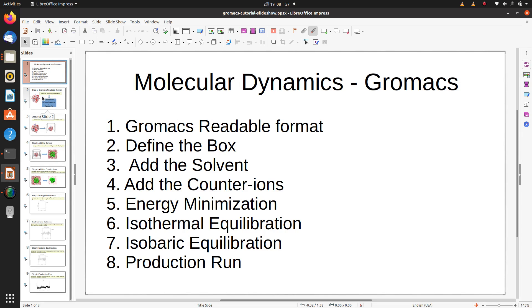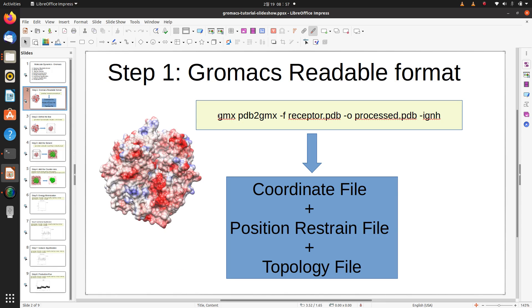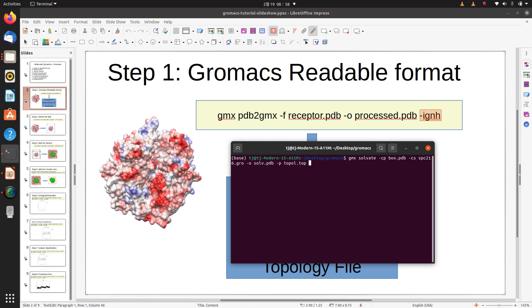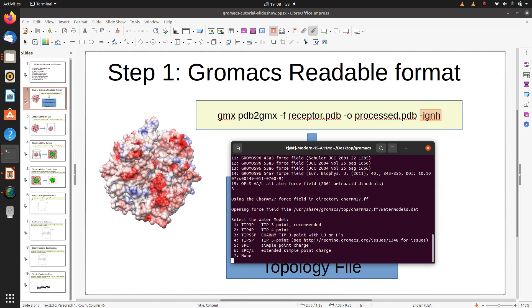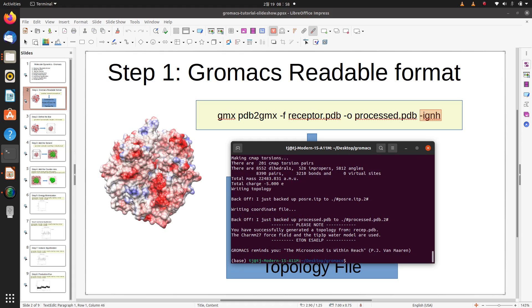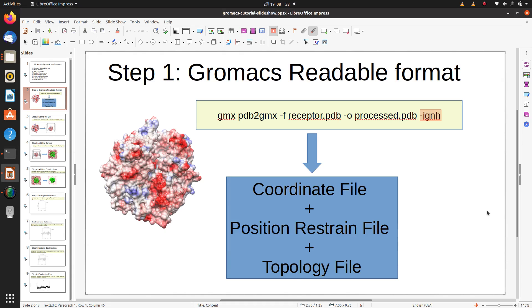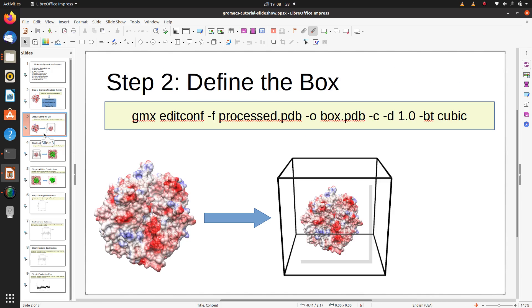The first step is to convert the PDB into GROMACS readable format. This is done using the command: gmx pdb2gmx, with the -f flag specifying the protein file name, the output file, and the -ignh command to ignore hydrogens. It will ask you to select the protein force field — I used CHARMM — and the water model — I used the TIP3P water model. Running this command generates three files: the coordinate file, the position restraint file, and the topology file.